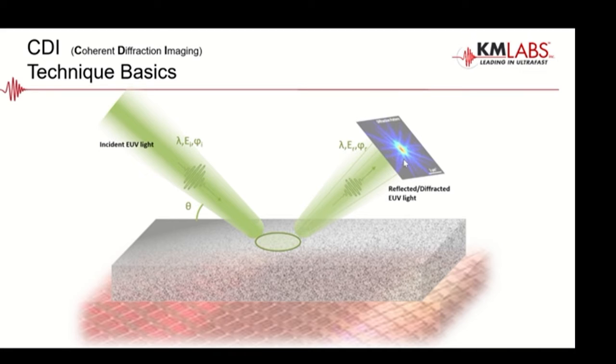a direct image of the sample the way we would intuitively expect to see it, but it's actually some kind of more complicated diffraction pattern that looks like this. And basically what this is showing is it's taking a Fourier transform, or a frequency transform, of all the various features that exist on our sample and putting them into frequency space, and we're detecting this frequency diffraction image. So there's a lot of information in that, but clearly, without having the lens here that you would have in a normal microscope, it's not necessarily intuitive what we're looking at there, the way we're classically used to in microscopy.